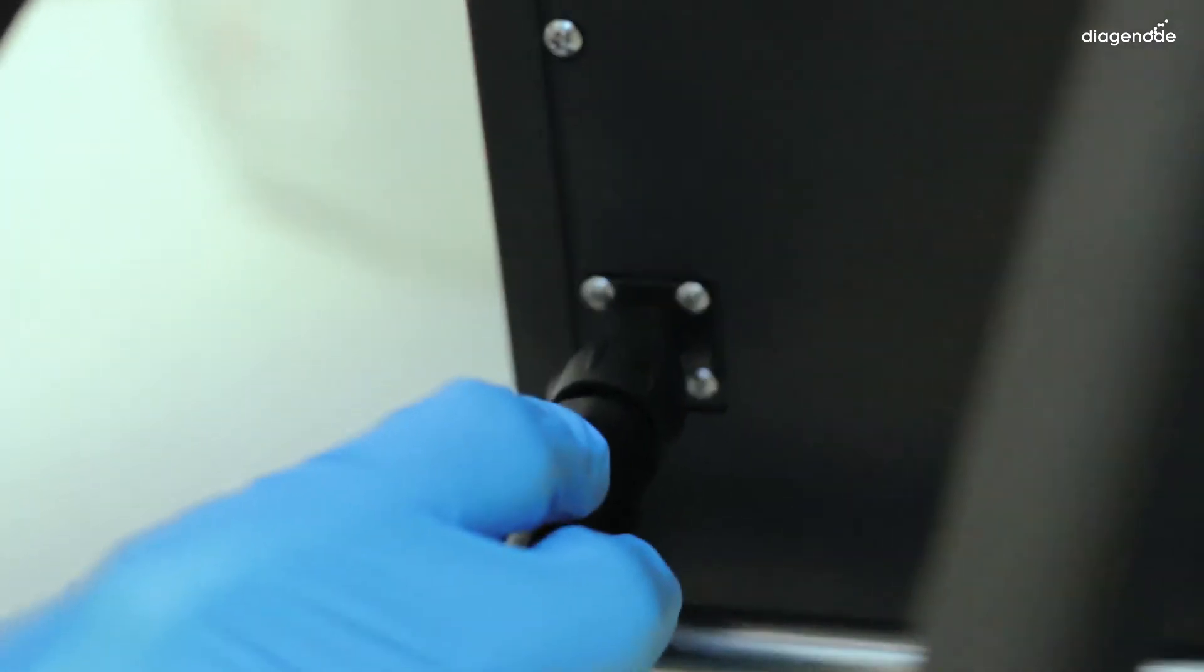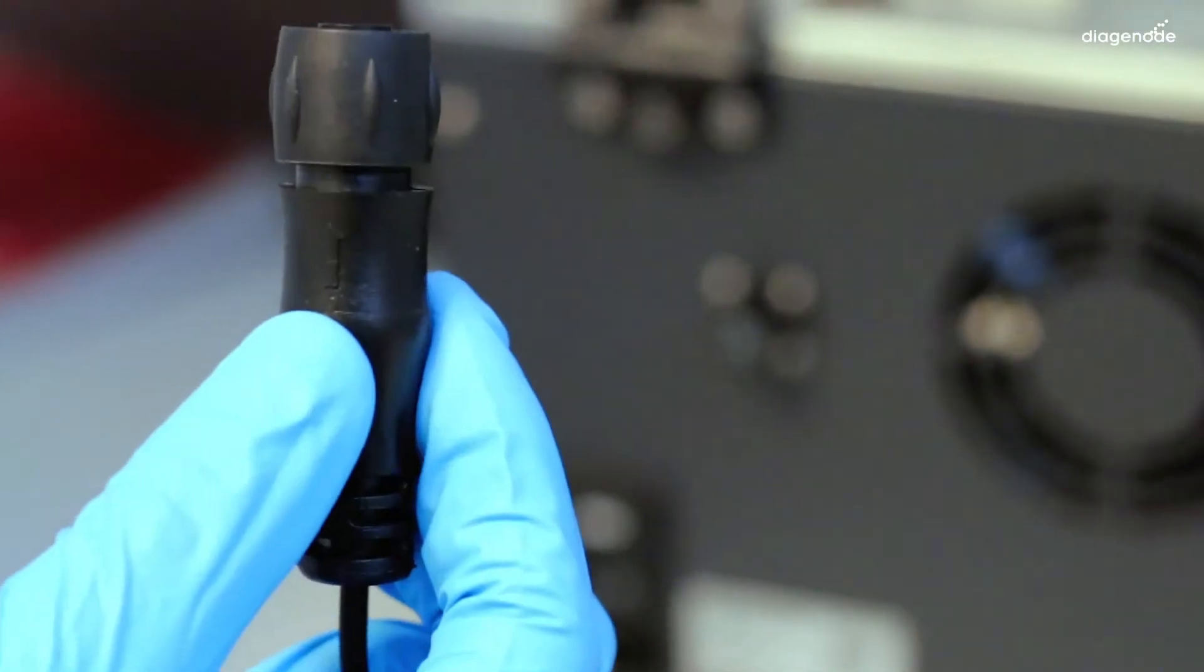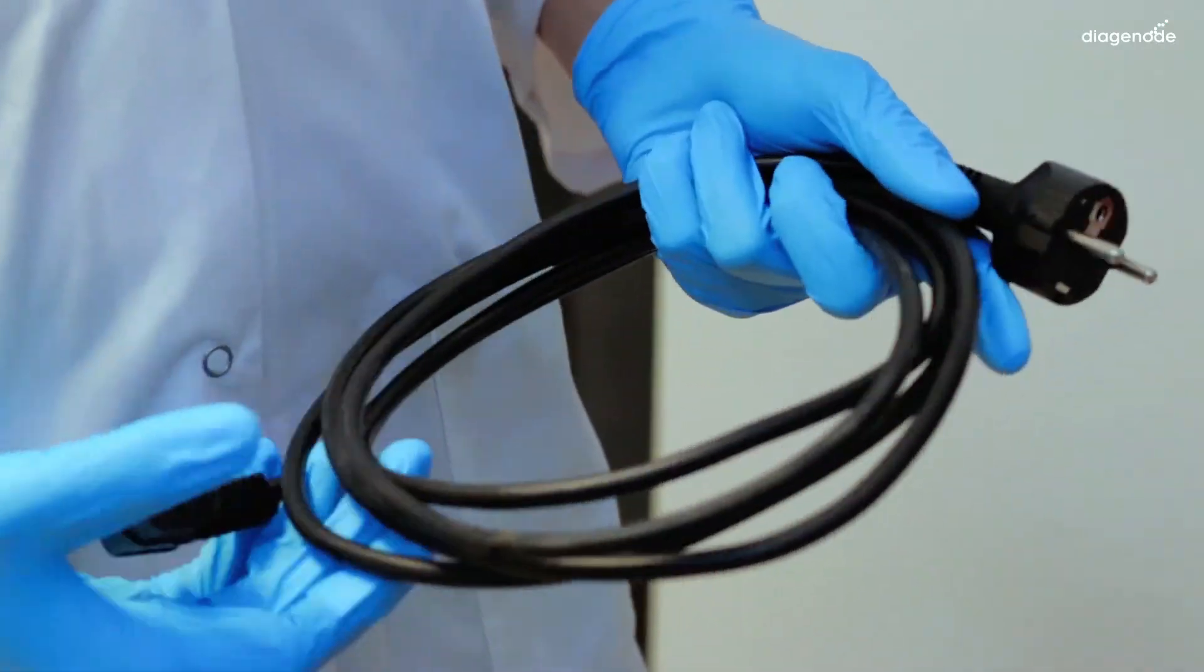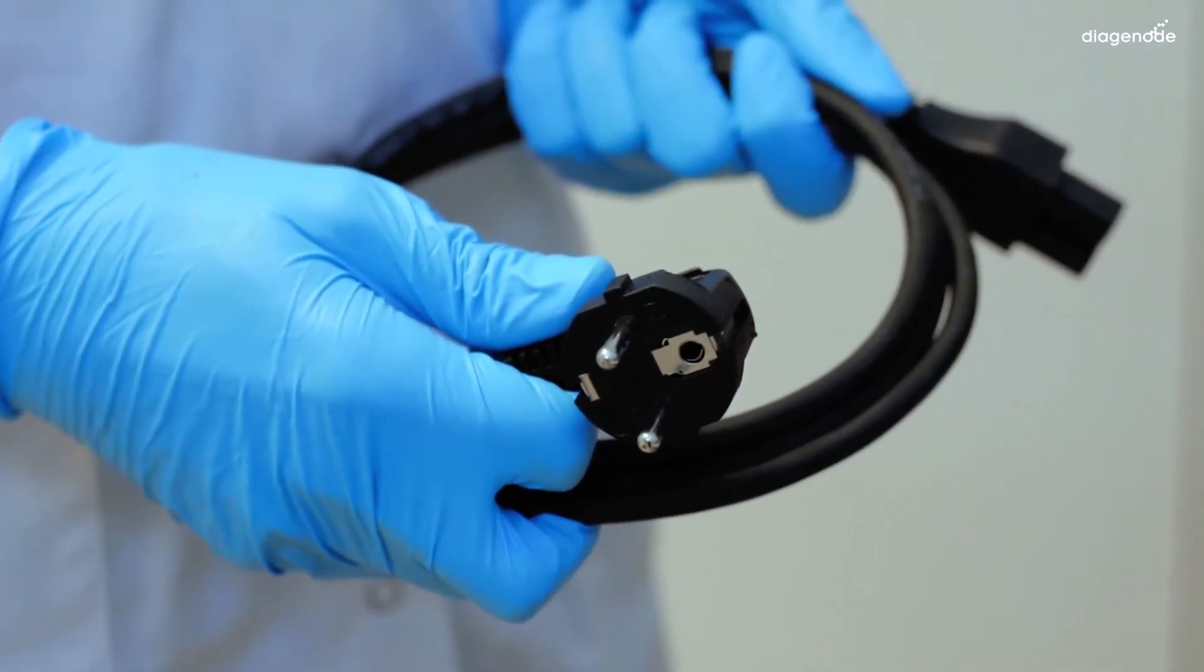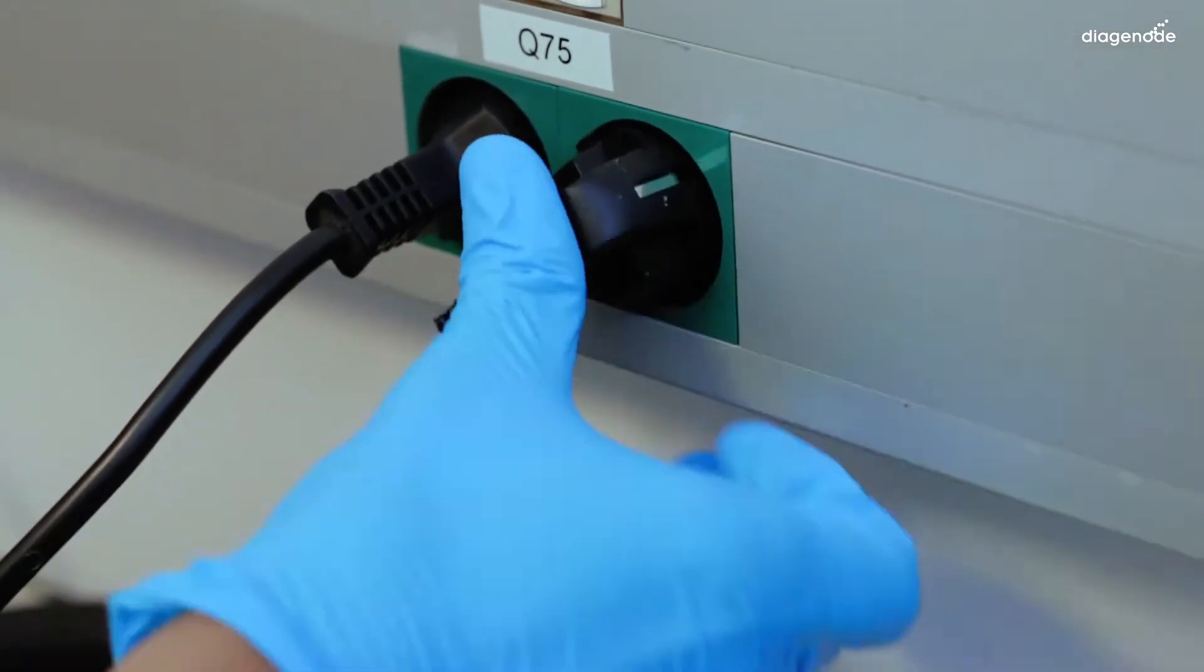Plug the valve connection cable on the back side of the BioRuptor cooler and on the back side of the BioRuptor Pico. And connect the sonicator with its own mains cable. Plug now the power cord into the outlet of the cooler and connect it to mains.